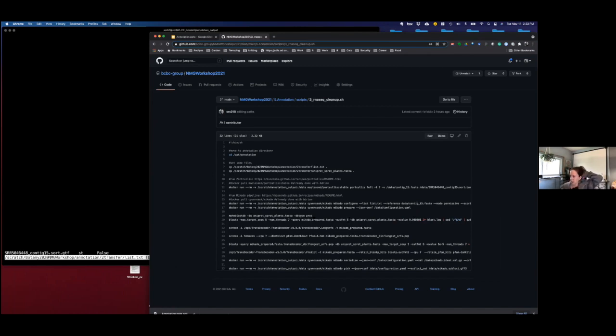Then the next step is it takes the, so these steps up here create a file called Mikado prepared FASTA. And that's just sort of like its first guess at what some gene models might be based on your input data. So based on that GTF file and the BAM file. So once you have that file, then it runs BLAST against your UniProt database.